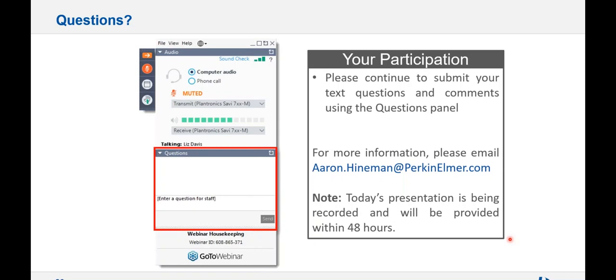He said, I'm looking for the pyrometric test with 1200C and Hga. I think he's talking about calibrating the pyrometer. Well, that would be something that service would do. It's that little tiny set screw that's on top of the pyrometer.